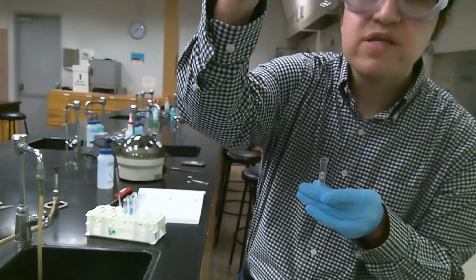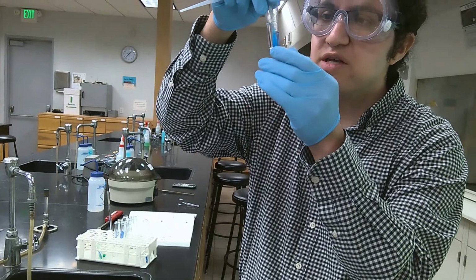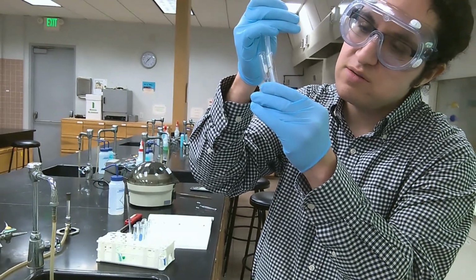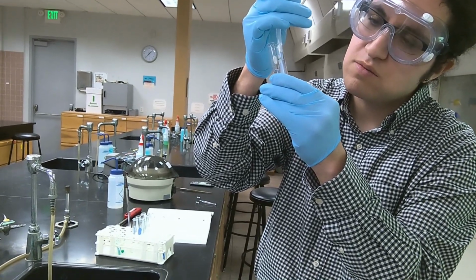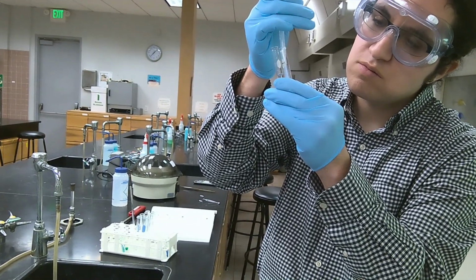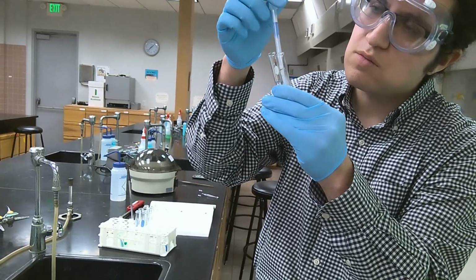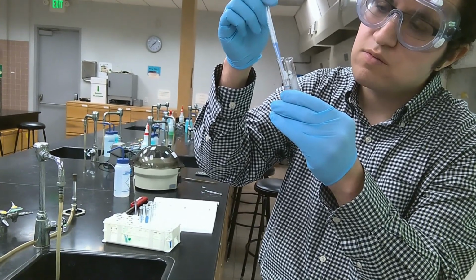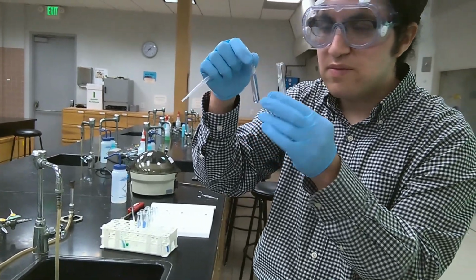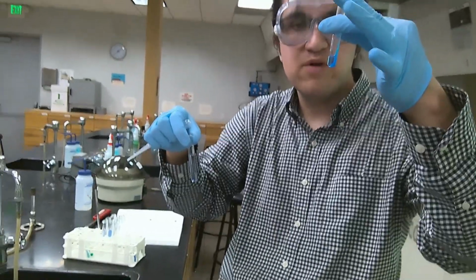So notice how it's completely clear, no solid particles. You want to minimize the amount of solid that we have lost in this transfer process. Now it's not going to be perfect, but you want to remove as much of the liquid as possible before evaporation.